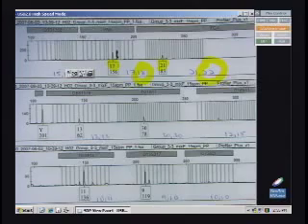So you did get the 21, but you didn't get the 22. Yeah, there's a blip there. You did get the Y, but not the X. The 13 came up. 30 came up. You see, there's some blips here. We don't know. Maybe those were it, of the 12, 15.